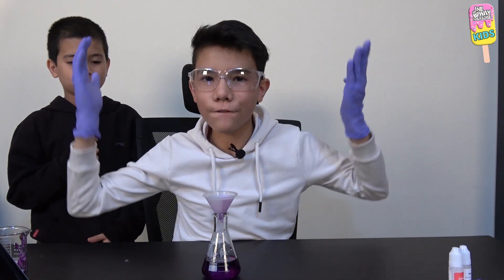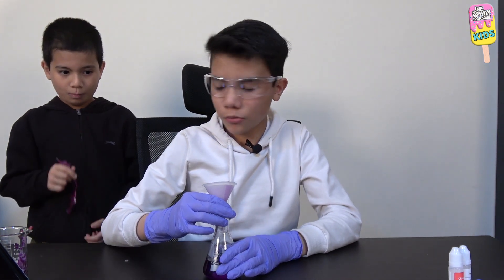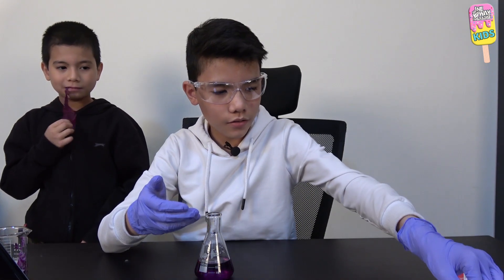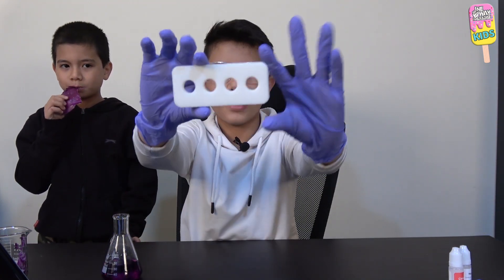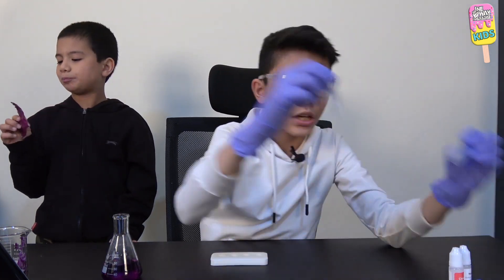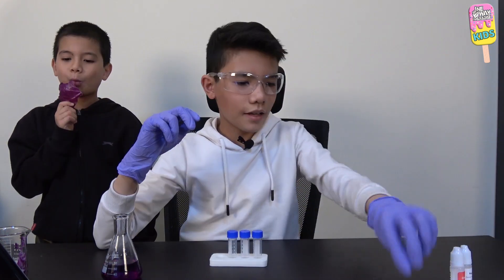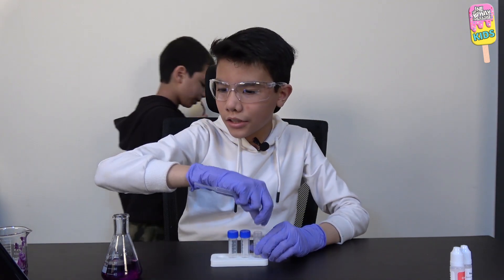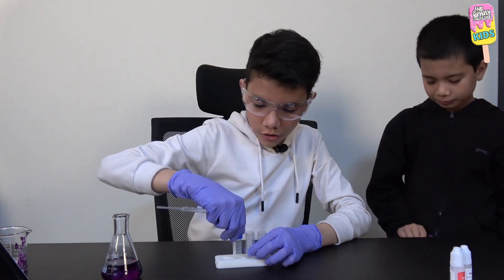It finally finished dripping. Alhamdulillah. Now I'll remove the funnel, throw away the filter paper, put the funnel away, and get my test tube stand and arrange three test tubes. Now I'm going to get the pipette and put three milliliters of this cabbage water solution into each of the three vials.